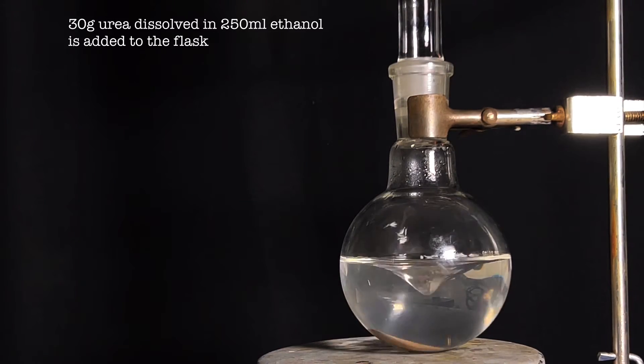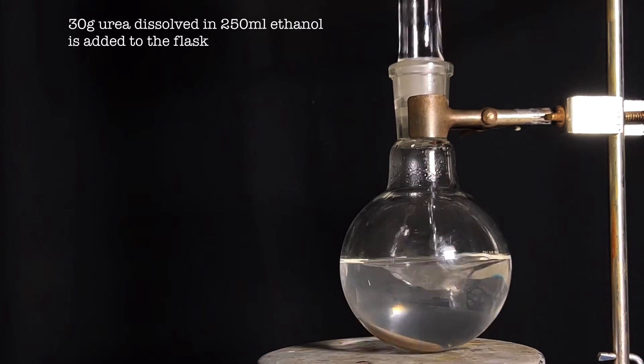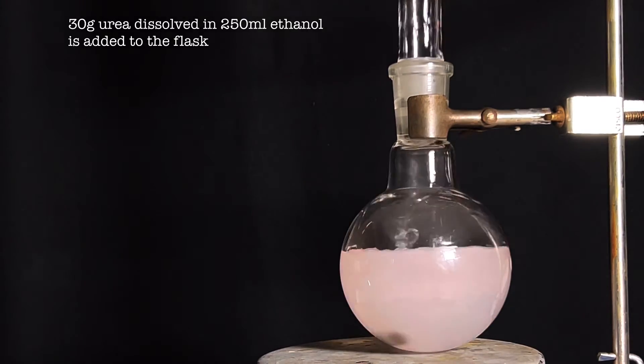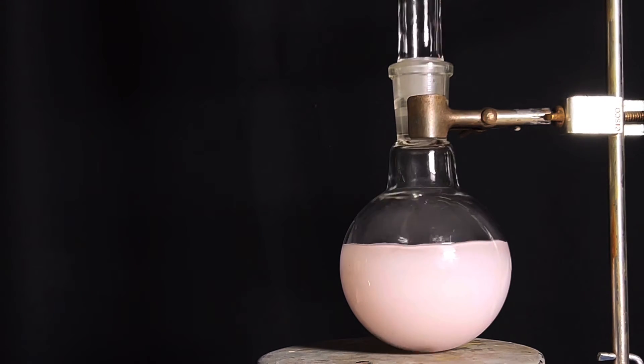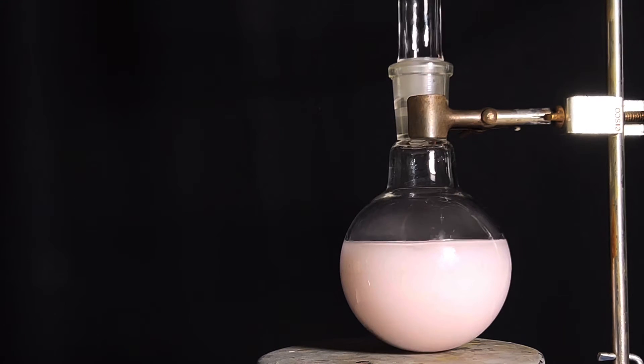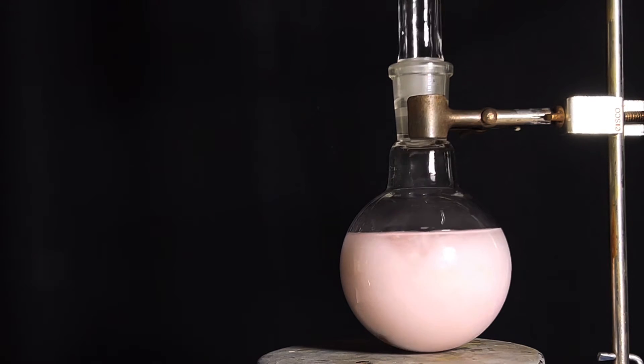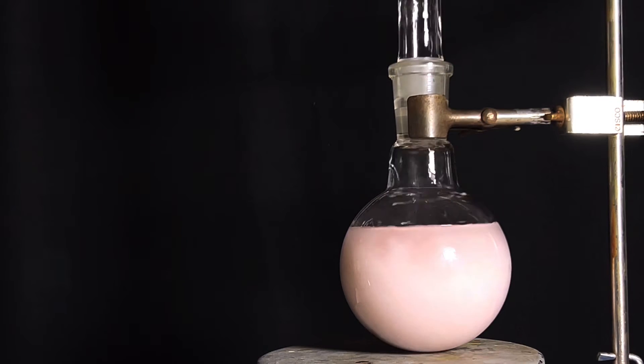Now a solution of 30 grams of dry urea in 250 ml of hot absolute ethanol was added through the top of the condenser. Note that the urea should be perfectly dry. I dried my urea in a vacuum desiccator alongside anhydrous calcium chloride for one week. A thick white precipitate formed. I thought this was barbituric acid, so I tested it, but it wasn't. The literature also mentions the thick white precipitate, so I left it as is and moved on.